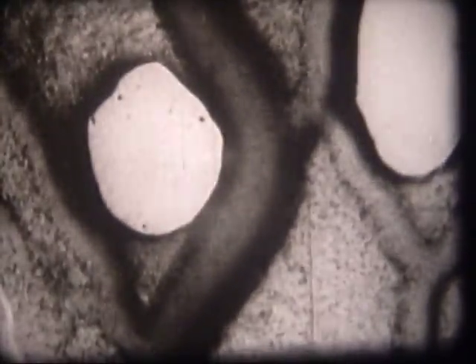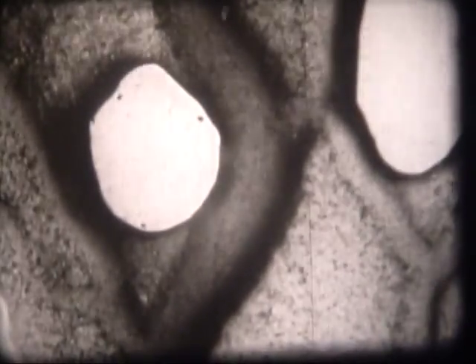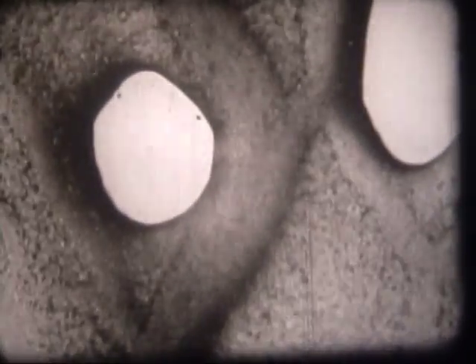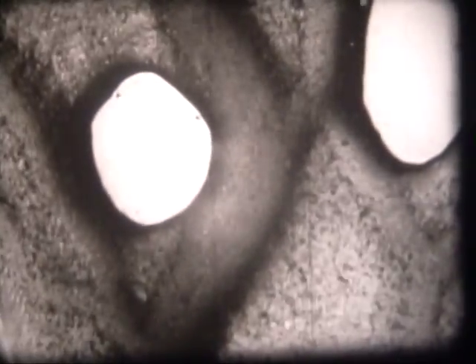Another specimen. It doesn't matter what I use to anesthetize protoplasm: ether, chloroform, cold, or I can even hit it on the head with little droplets of water. There you just saw the normal reversal in this culture. But in this case, it is carbon dioxide. But now the gas is on. Watch it. So sudden a cessation of flow could occur only if the protoplasm has solidified.